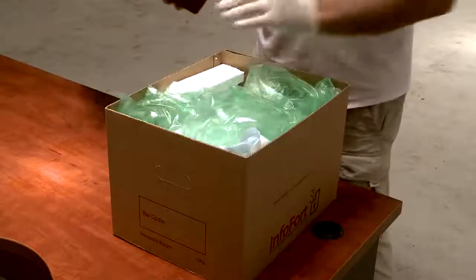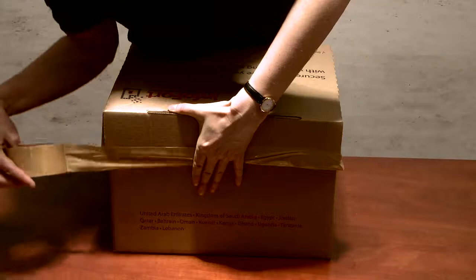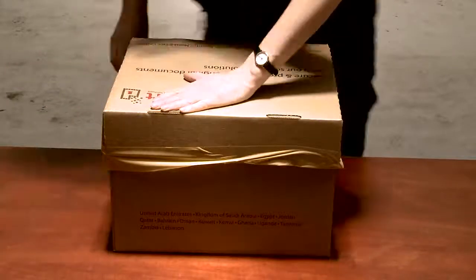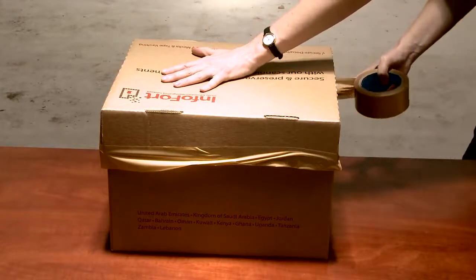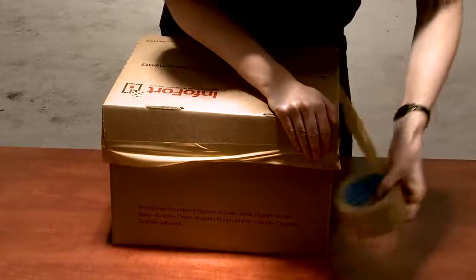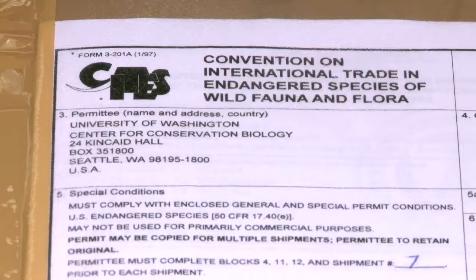Place a copy of the final data sheet inside the box with the samples. Externally reinforce the box with sturdy tape on all sides. The courier may request to see the contents, so only perform this step after the courier has agreed to accept it. Place a label on the outside of the box that has the laboratory's name and address.